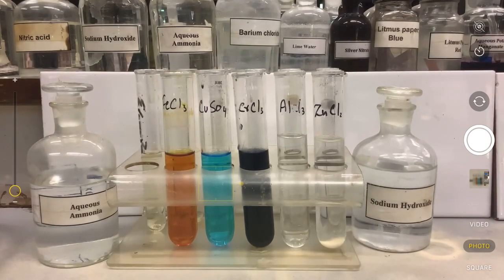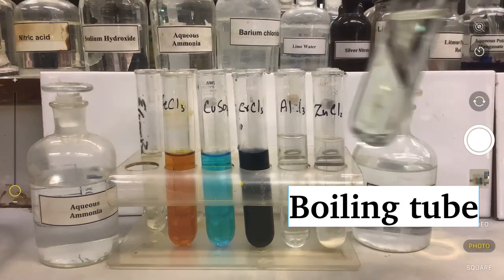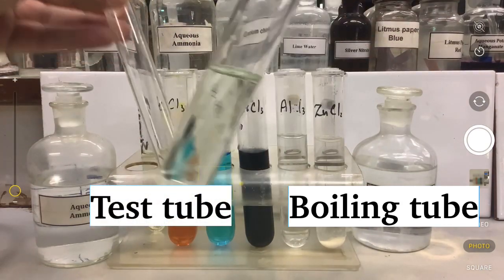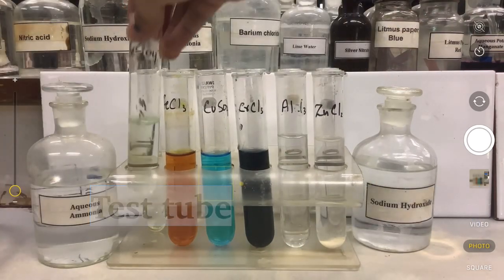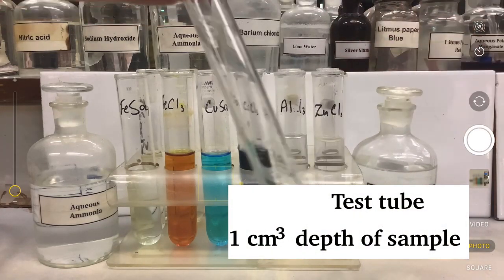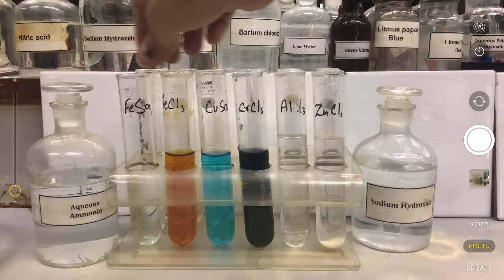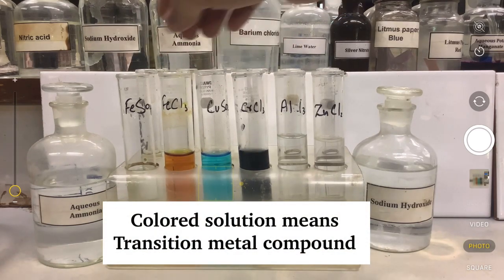The samples are given to us generally in a boiling tube, which is a glass tube containing the sample and used for heating. We perform the test in a test tube, which is a little thinner than the boiling tube. Test tubes don't have any graduation on them, but in a test tube we carry 1 centimeter cube depth of sample. The reason is that we don't want to waste chemicals, and it's better to perform smaller testing on small samples.